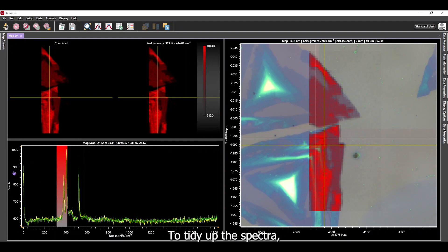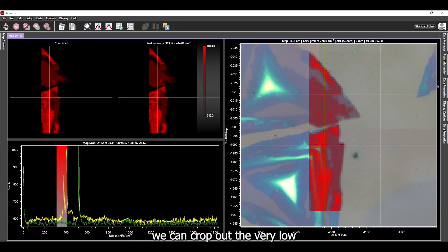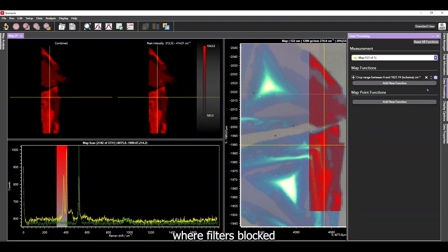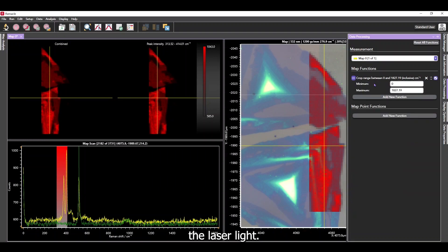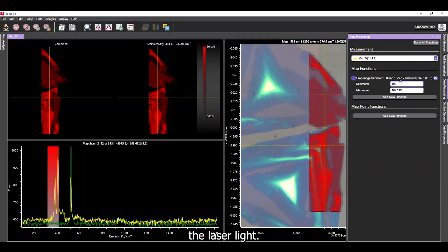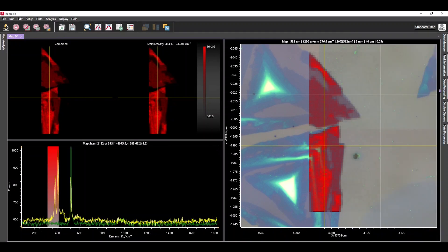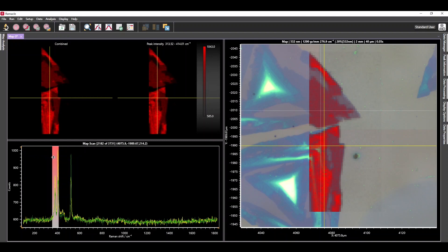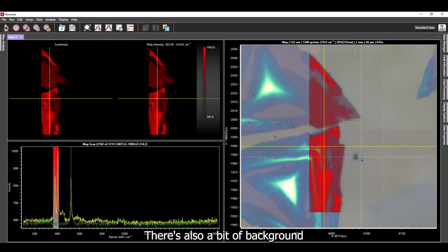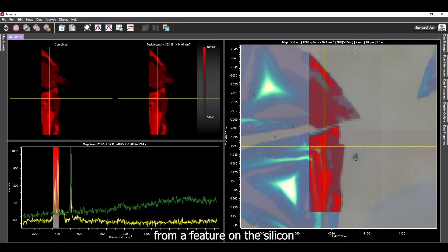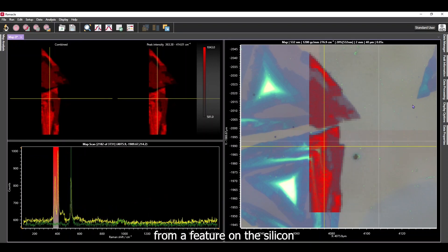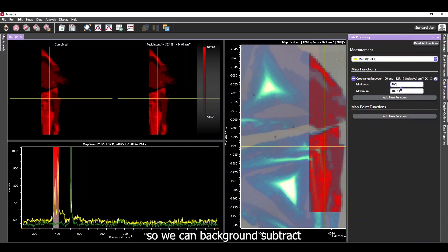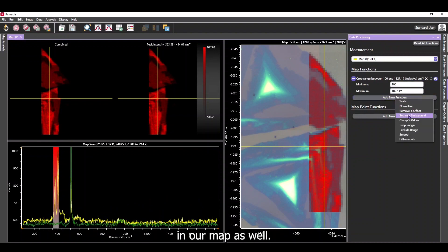To tidy up the spectra, we can crop out the very low wave number region where filters block the laser light. There's also a bit of background from a feature on the silicon, so we can background subtract all of the spectra in our map as well.